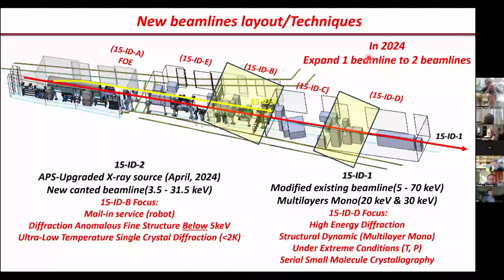I apologize, I have to look at the new diffractometer. The new diffractometer maybe can have a kappa arm, so an axis can be aligned. I have to double check because the crate is sitting on the floor and I haven't opened it. We'll have to test.